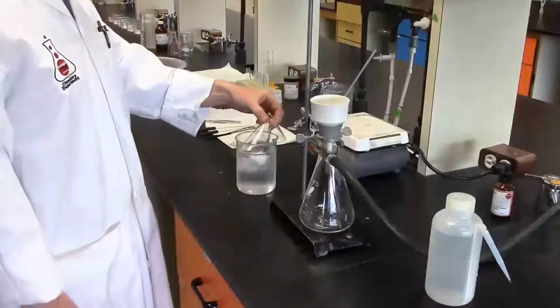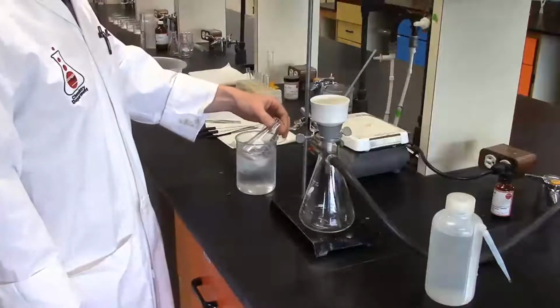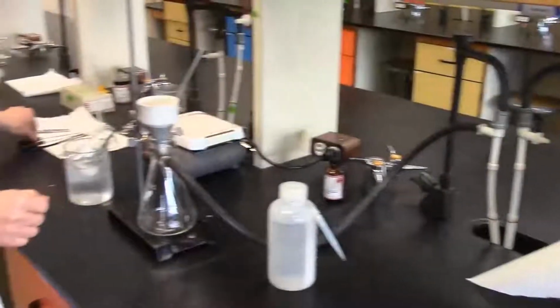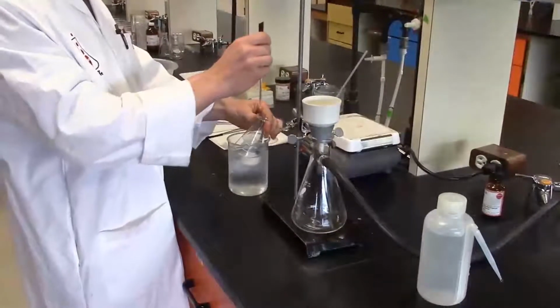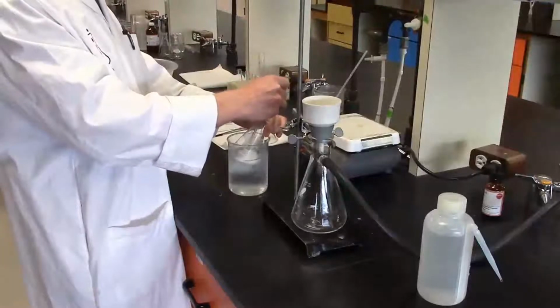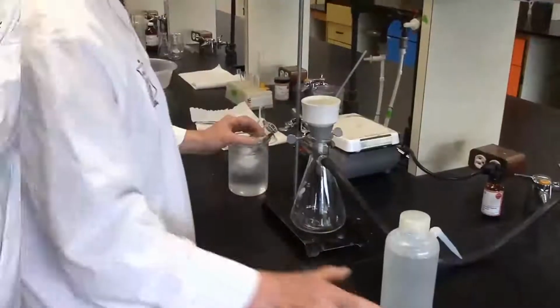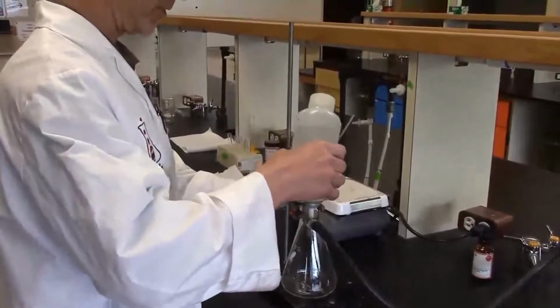My crystals have been sitting in the ice water bath now for 10 minutes. I don't think there's going to be any further crystallization. I'm ready to do the vacuum filtration. Before I do the filtration, however, I noticed that there are some fairly large clumps, and so to have easier transfer of my aspirin solid, I'm just going to break the clumps up a little bit. So I'm going to wet the filter paper and get a good vacuum seal.